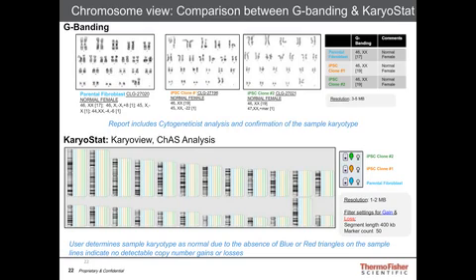This slide shows that KaryoStat assay results are consistent with G-banding results. We derived two iPSC clones from a parental fibroblast. G-banding confirms that both the parental line and the derived iPSC lines are normal and female cells. So does the KaryoStat assay, as there are no chromosomal abnormalities detected. Cyan lines represent the parental line, orange and green lines represent iPSC clone 1 and 2 respectively.